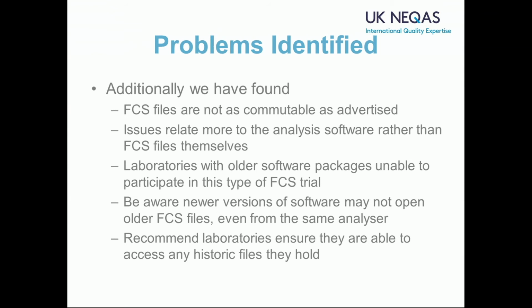So if you have newer versions of the software, it also might not open your old files. We also saw the reverse version of that. Even if it's from the same analyzer, if you're using version X and historically you used version Y, you might not be able to open them. So we'd really recommend that you make sure you can open any historic files that you're storing.